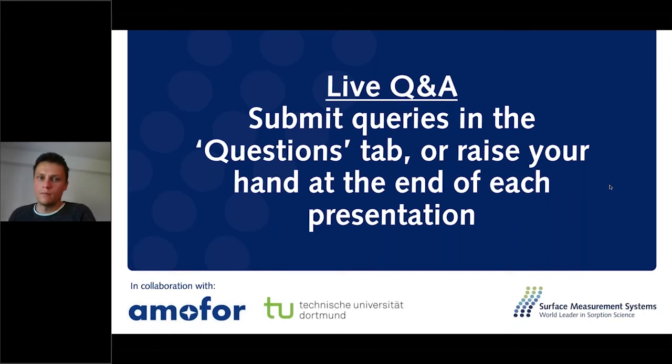Okay, thank you. Second question, how is thermodynamic activity being measured or calculated? The thermodynamic activity is very hard. It depends on which thermodynamic activity we are talking about. If we want to measure the water activity in a formulation, we can directly take the DVS to measure that. IGC and DVS are typical water activity measurements. IGC, for example, at infinite dilution, activities at infinite dilution, DVS at a certain composition.